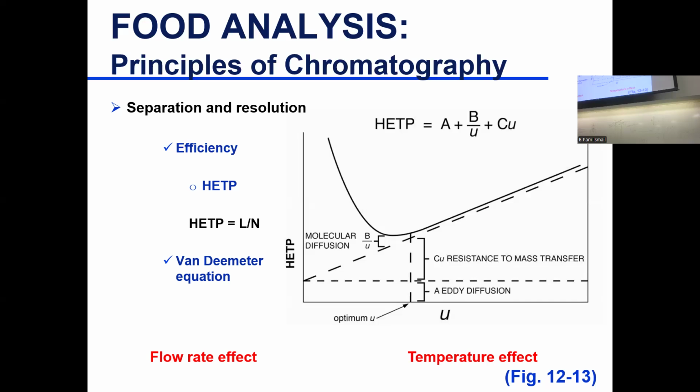What is this again? Longitudinal diffusion. Okay, so A we figured. Now longitudinal diffusion happens all the time. When you go from a high concentration to low concentration, it diffuses. So there is diffusion that is always happening from this point to this point. So there is in and out, but there's also longitudinal diffusion, LD, always happening.